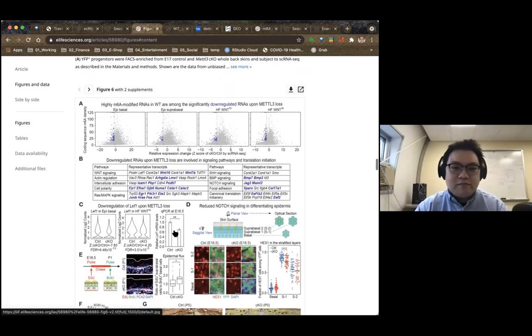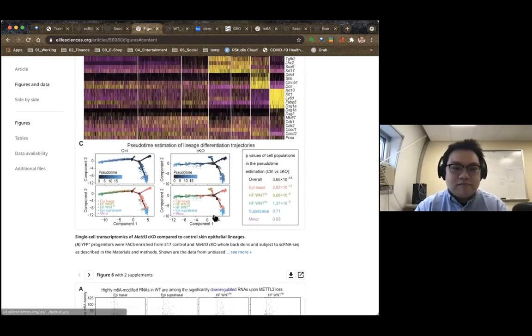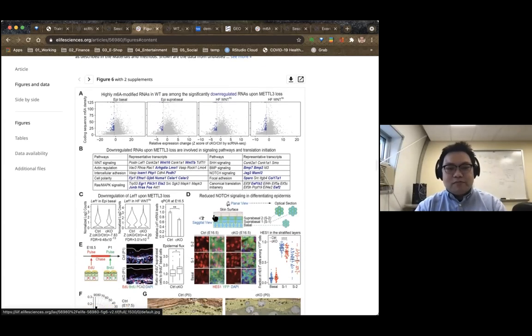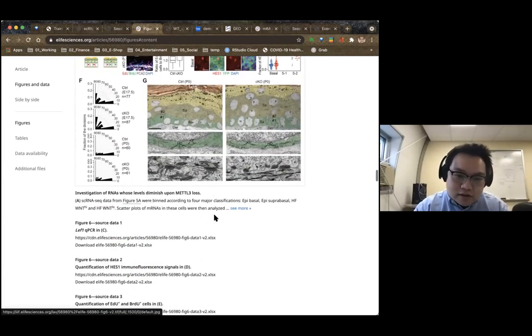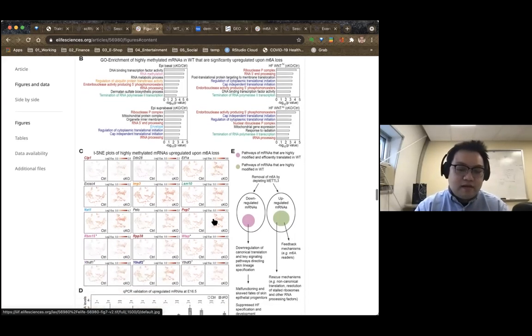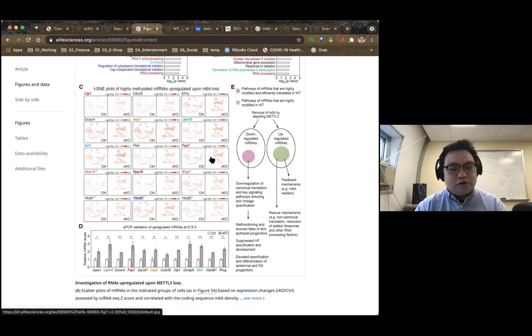Based on this information, we can compare differential gene expression between two datasets, and for each cell type between two datasets, and calculate the single cell gene set enrichment analysis for each dataset, and then provide a feature plot like this.